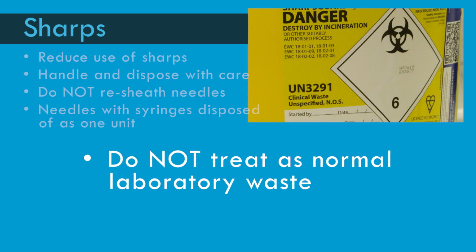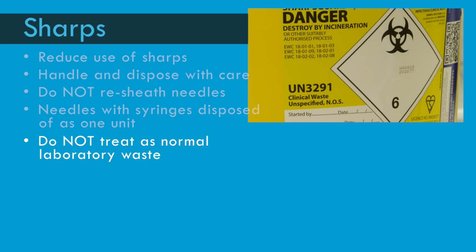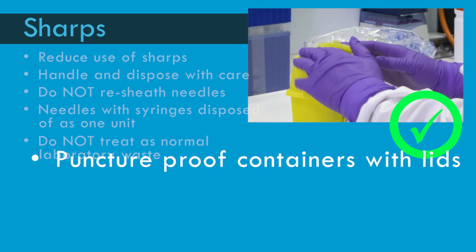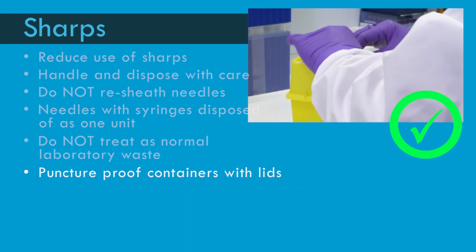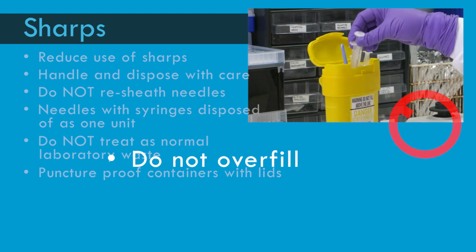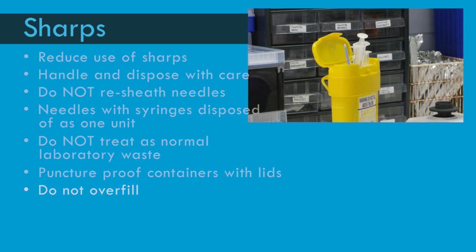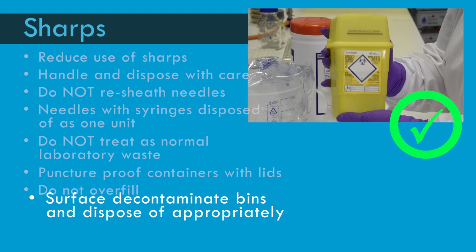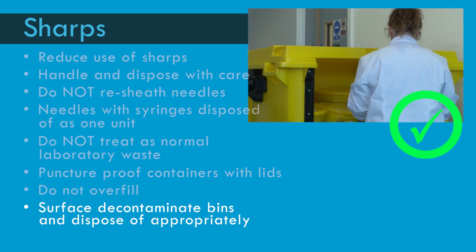Do not treat sharps as normal laboratory waste. Dispose of sharps using puncture-proof containers fitted with lids. Do not overfill sharps bins or other waste containers. Sharps bins must be surface decontaminated before being disposed of appropriately.